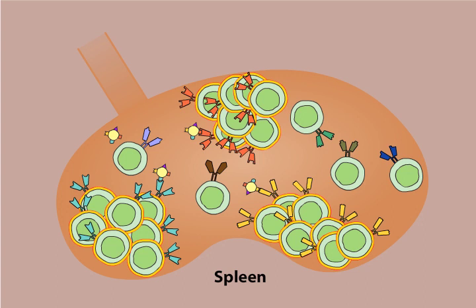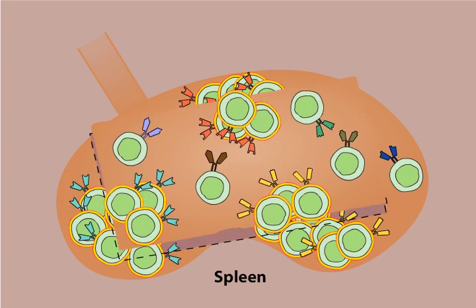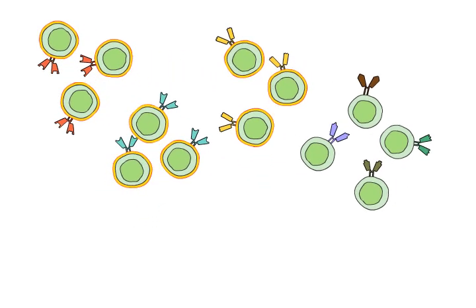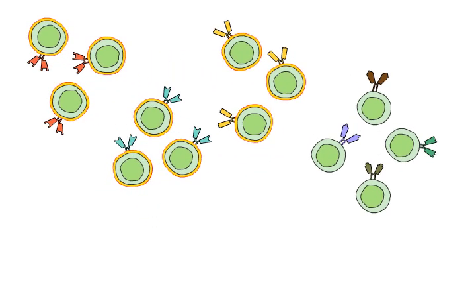Usually a single exposure of a mouse to an antigen is not sufficient to generate a strong immunogenic response. It is typical to immunize the mouse a total of 3 times, at days 0, 14, and 21. This increases B lymphocyte colony formation and the antibody titer. Next, a population of spleen cells is removed from the mouse. This includes the B lymphocytes with protein X-specific antibodies and nonspecific lymphocytes. The spleen cells die after only a few cell divisions.